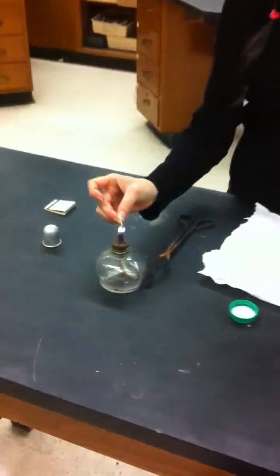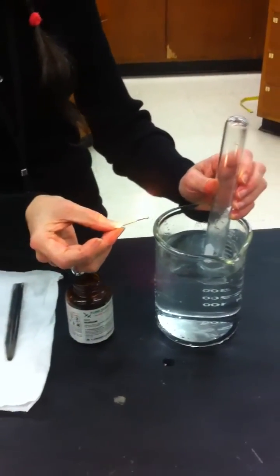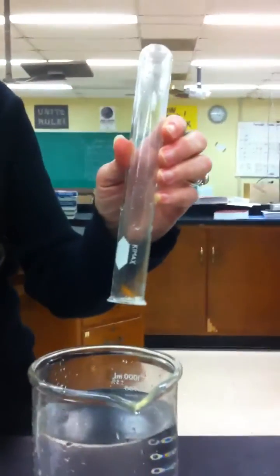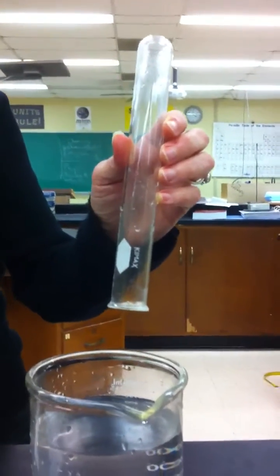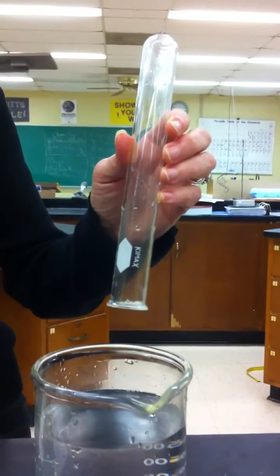I want you to watch the edge of the test tube as I do this. The flame is still going, still going, still going — just went out.